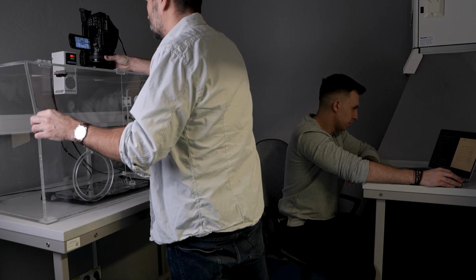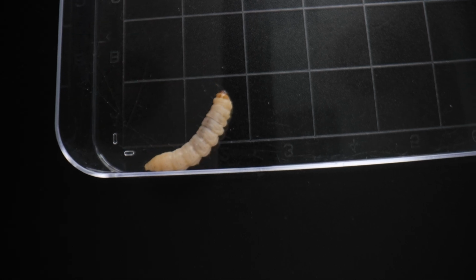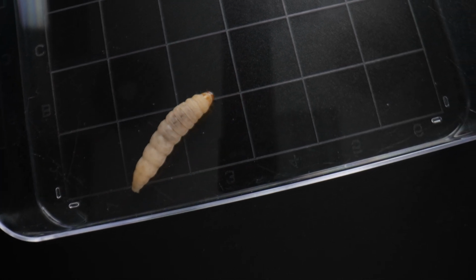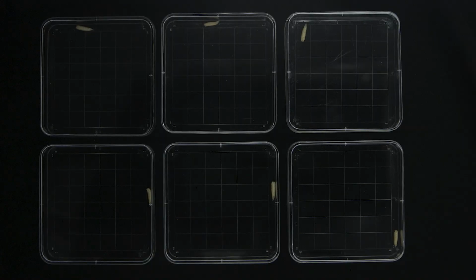As for tracking, there are practically two ways to do this. One, by using the industry-standard algorithms included in Python libraries like OpenCV, or two, by using deep learning to teach the system what a larva looks like. We decided to test both methods, and here are our findings.